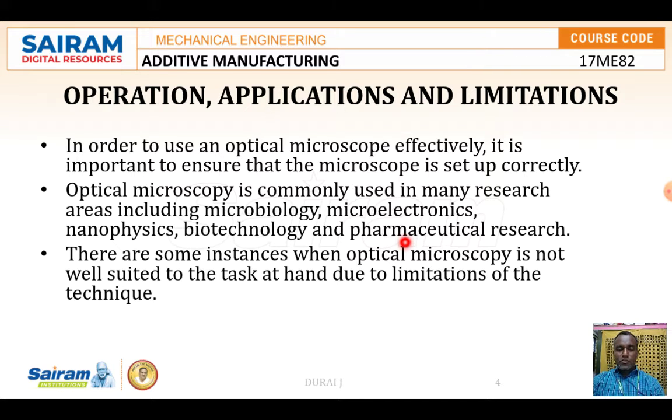And also, the advantages of this microscope device are that it has a medium cost, as well as being a simple device. Once we view the component, a normal scale can be attached, from which we can find out the size.